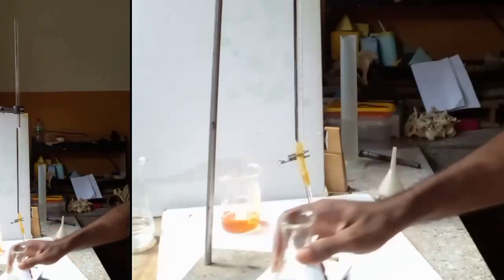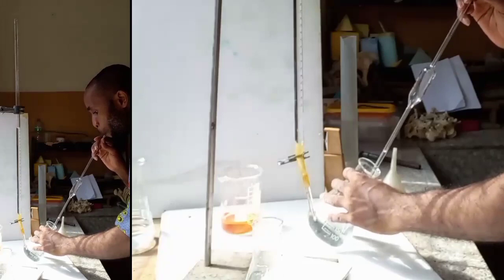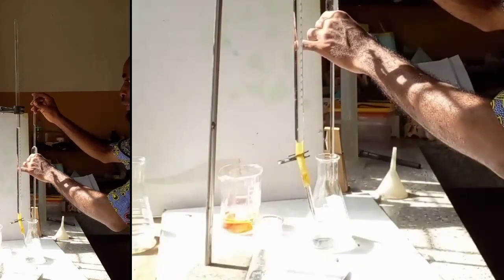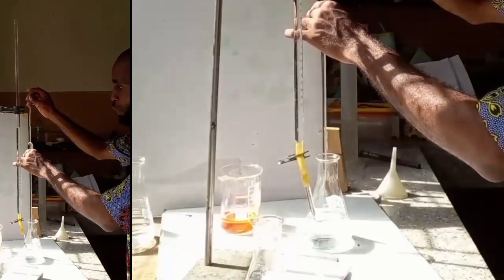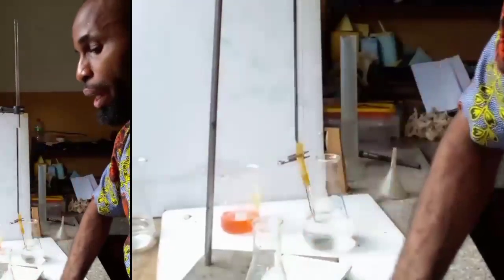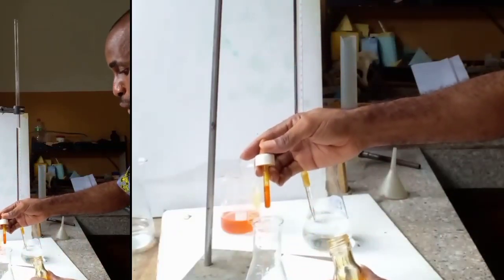Now this is my B. Rinse it. We titrate it by, first of all, pipetting. I'm releasing it so that I can have it at the 25 cm mark. I add the indicator material.